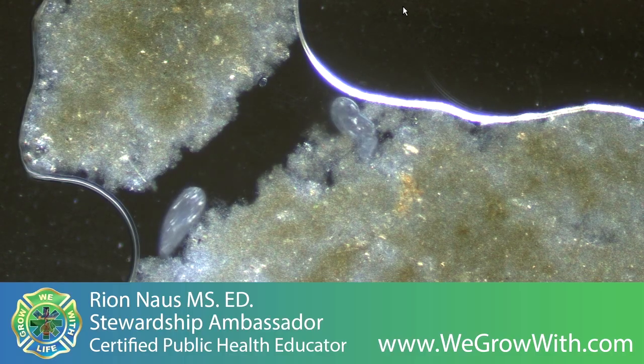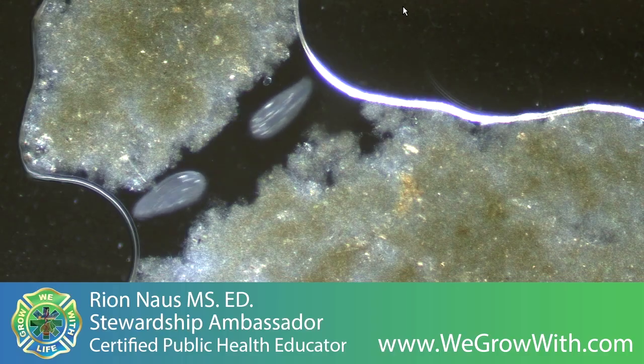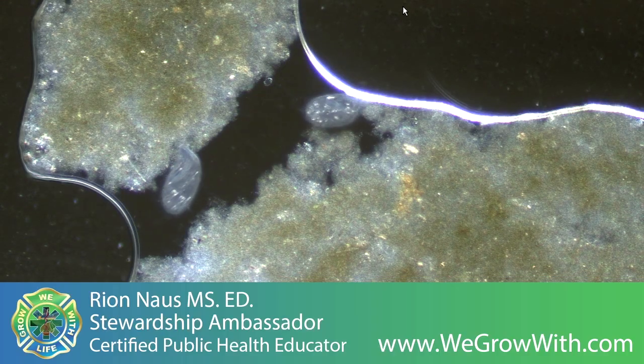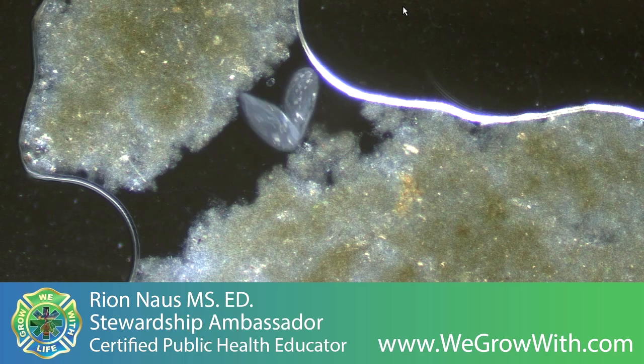And so they cleave off and others are along for the ride and get squished together. I'm not sure if this one will get cleaved off or squished together because of how much separation those ciliates have caused. And so it might cleave off.